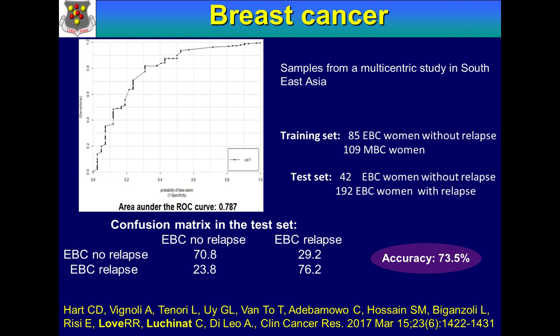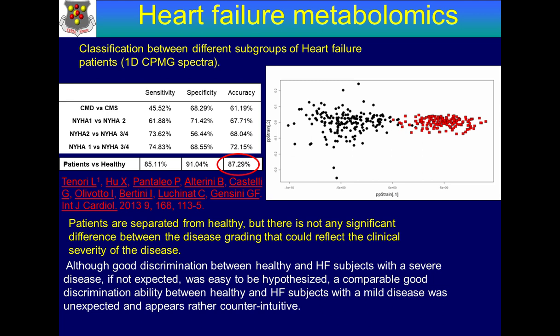And this study was later validated on a larger cohort, which was very heterogeneous, from different hospitals in the Philippines and Vietnam and Bangladesh and a couple of countries in Africa. And the prediction was slightly lower, but still remarkable, accuracy 73%, which was somehow telling us that the predictor is robust enough to be further tested on larger cohorts and perhaps even adopted as an additional tool in clinics. As I said, accuracy is lower, but not that bad.